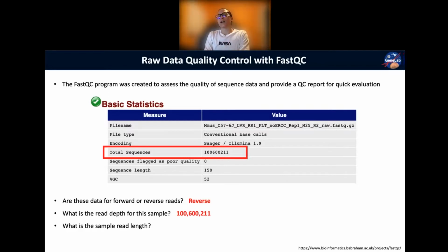Yeah, I mean, you have one forward and one reverse, but you called it R2. Yeah, good question. Some people do use F and R to indicate forward and reverse. In the notation that I used here, that R stands for read. So read one, read two. It's the second read. It doesn't necessarily mean reverse when you use R. But some people do use that notation, as Mike noted in the chat.